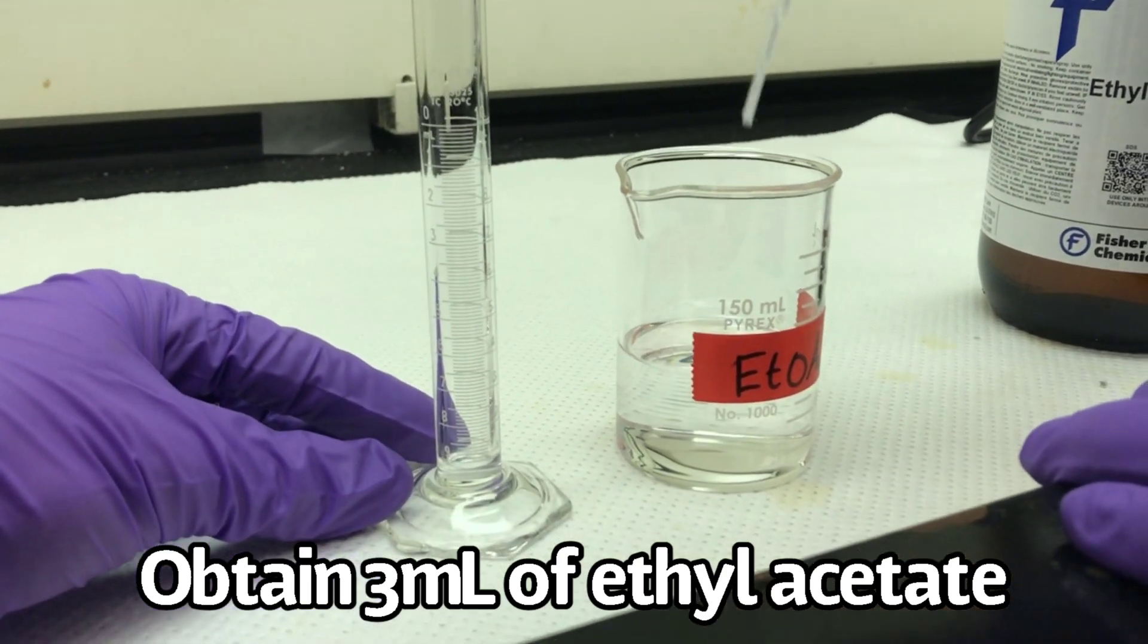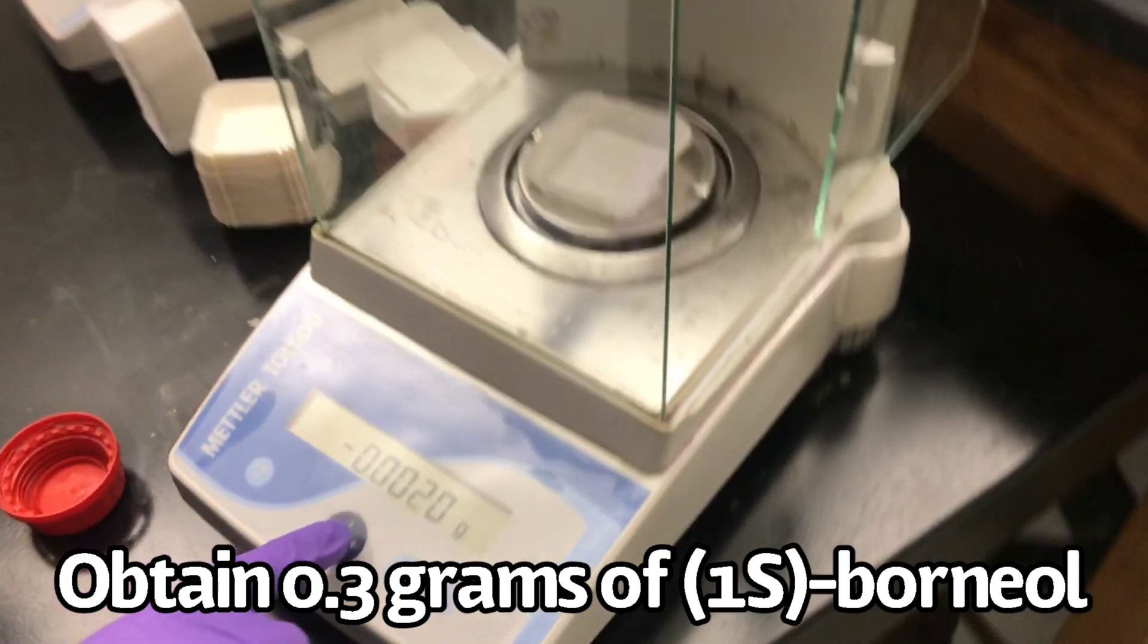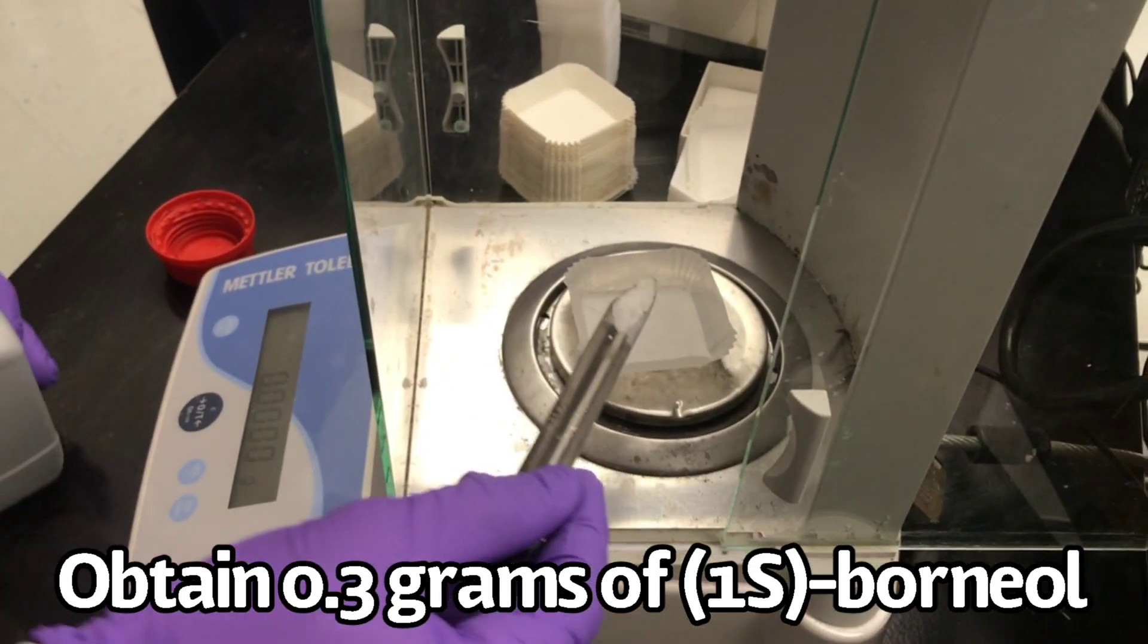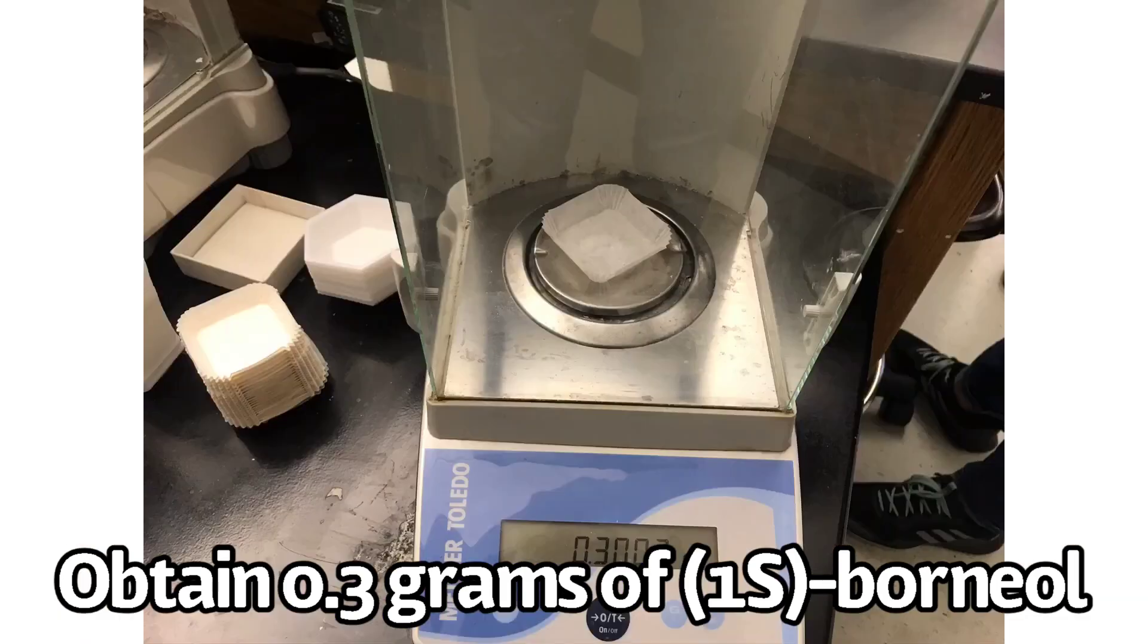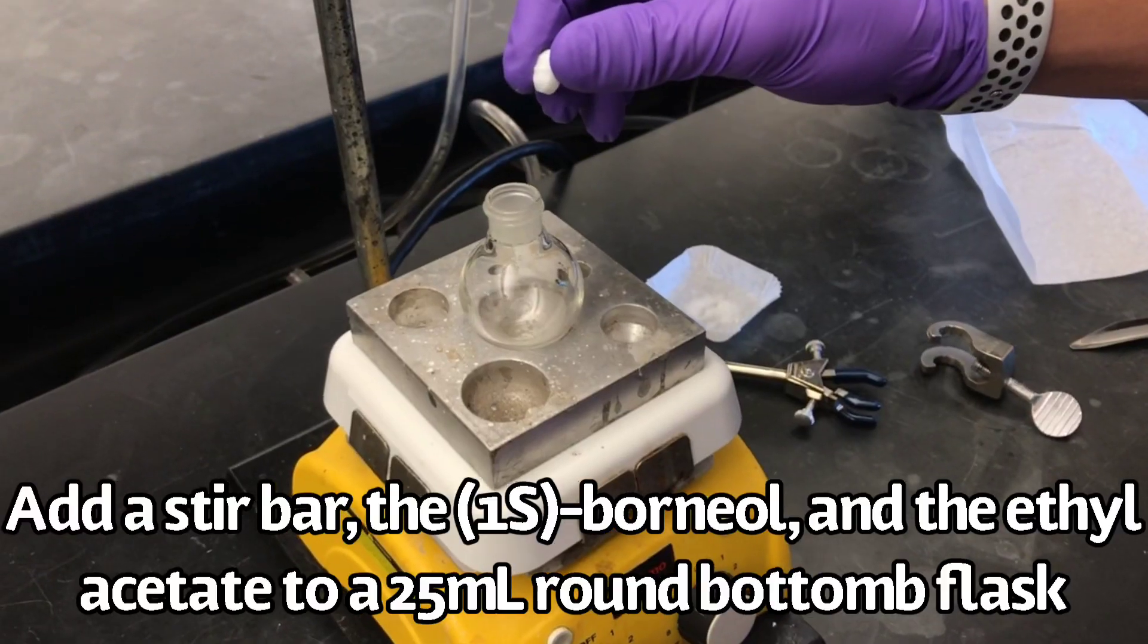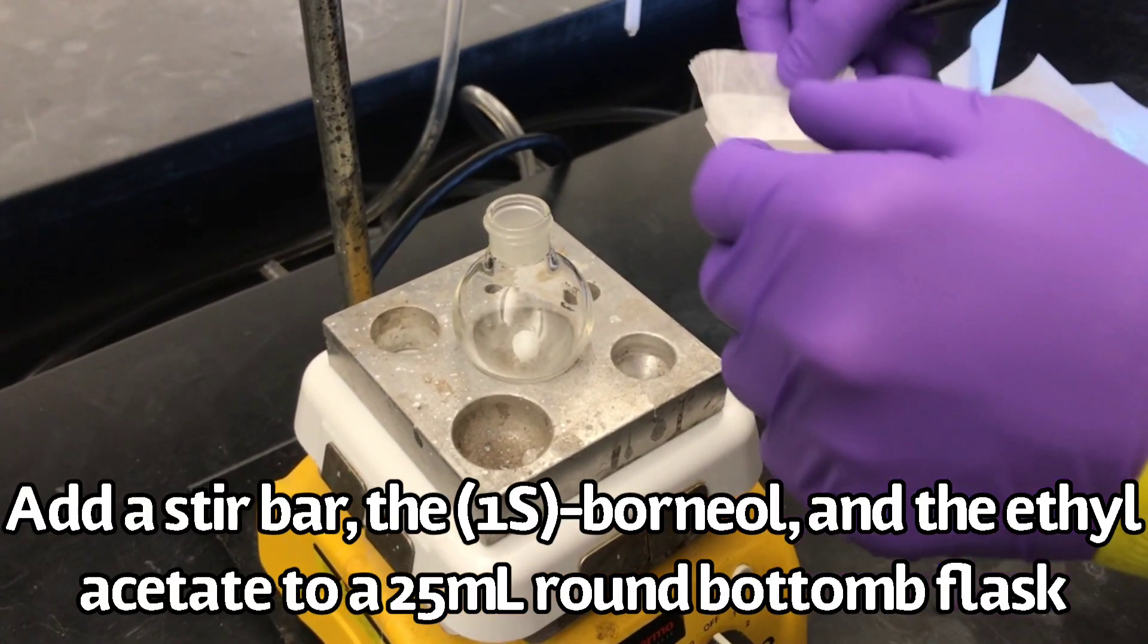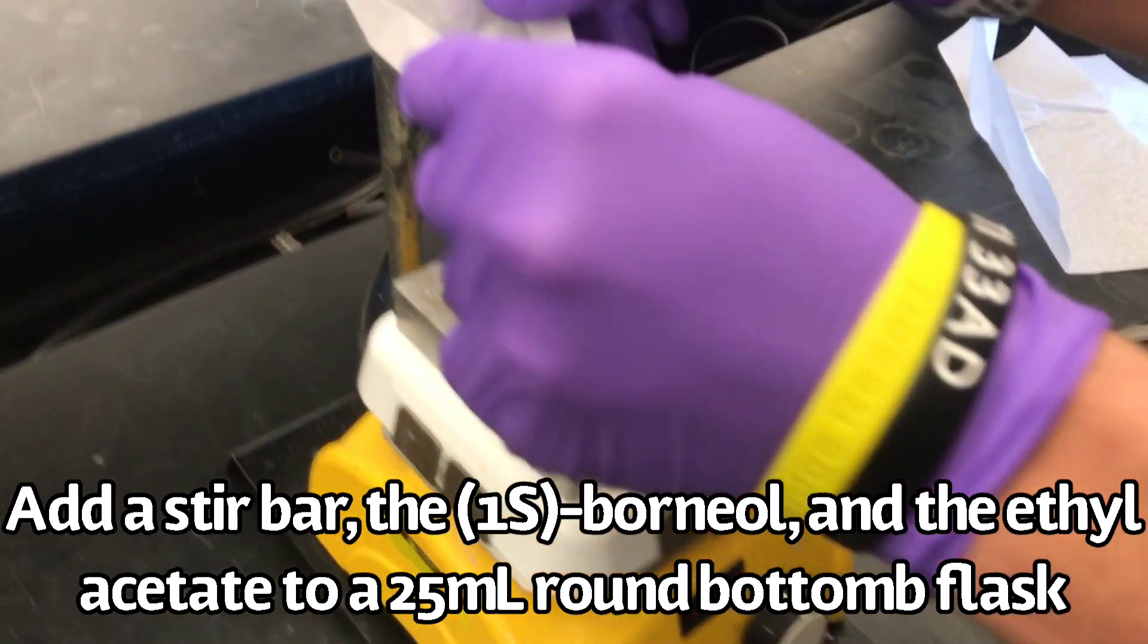Start by obtaining 3 milliliters of ethyl acetate. Next, obtain 0.3 grams of the S-enantiomer of borneol. Add a stir bar, the S-enantiomer of borneol, and your ethyl acetate to a 25 milliliter round bottom flask.